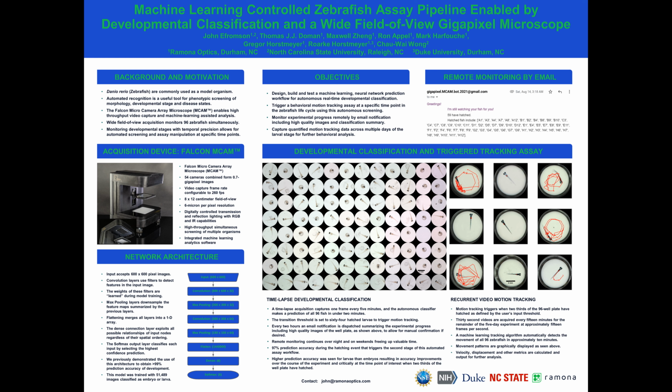This can be used to fine-tune experimental protocols to specific points of the organism's development.